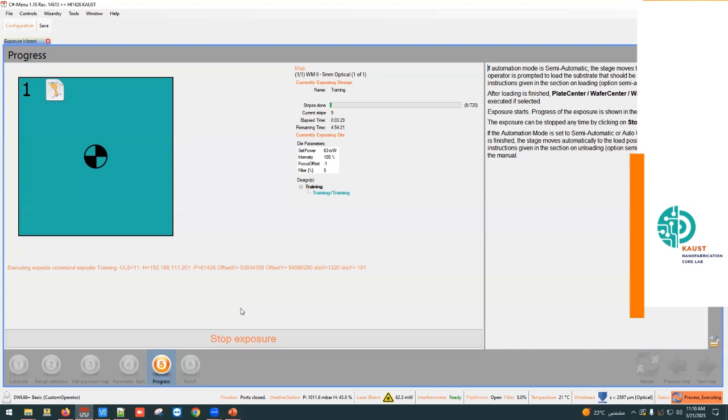One last question. Because we are using the highest resolution, what's the requirement for the photoresist? In fact, there is a specific way to get these 300 nanometers. You cannot use any substrate, any conditions, or any photoresist. You have to use a specific methodology that I will train people on to get this resolution.